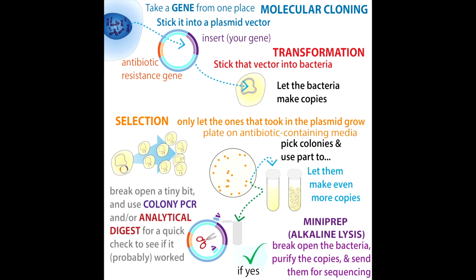So when you're using the glass beads, you want to make sure that you don't have too much liquid and that you actually do it till it dries, or else you'll get a bunch of colonies around the rim of the plate instead of spread all over. But basically you get these globby dots, and each of these globby dots represents a single bacteria originally that then multiplied and multiplied on top of itself, so you get this glob.